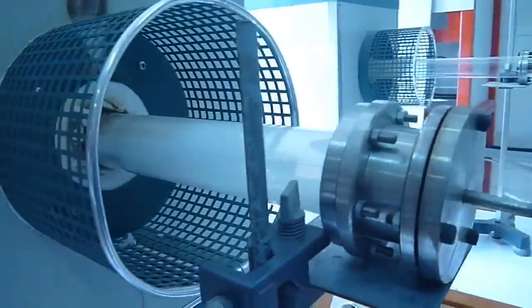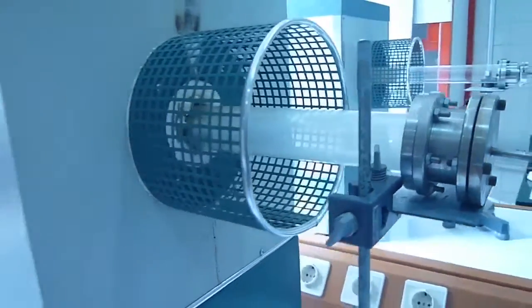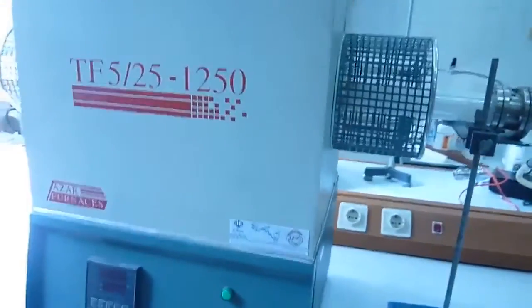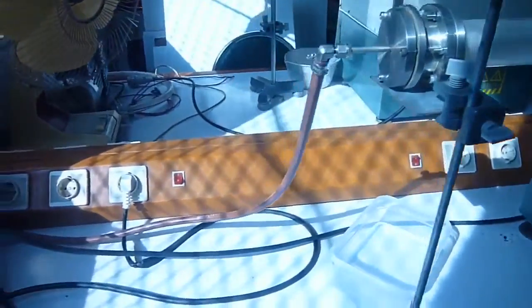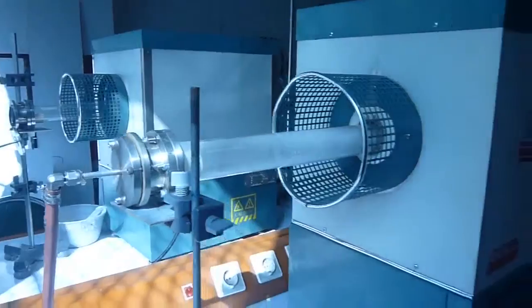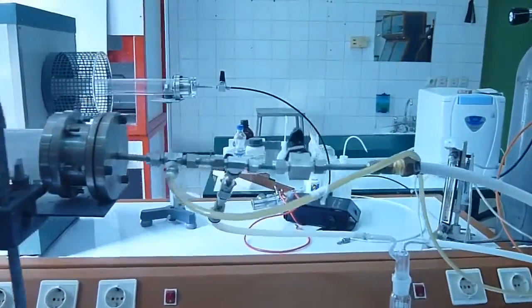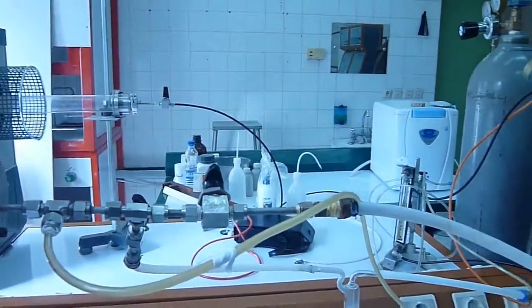Chemical vapor deposition is a chemical process used to produce high quality, high performance solid materials. The process is often used in the semiconductor industry to produce thin films. In typical CVD, the wafer substrate is exposed to one or more volatile precursors which react and/or decompose on the substrate surface to produce the desired deposit. Frequently, volatile byproducts are also produced, which are removed by gas flow through the reaction chamber.